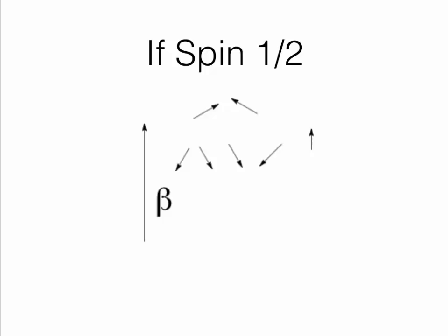And so a little mock-up is, here is a spin 1/2 set of particles placed in a magnetic field. The normal way to denote a magnetic field is with beta. Different spins can align either with or against the field in your collection or ensembles of atoms that are in the magnetic field. This angle of about 45 degrees is intentional for quantum mechanical reasons, but if you take all of these vectors and add them up, in the ground state there is a net magnetic field response to the external field aligned with that field.